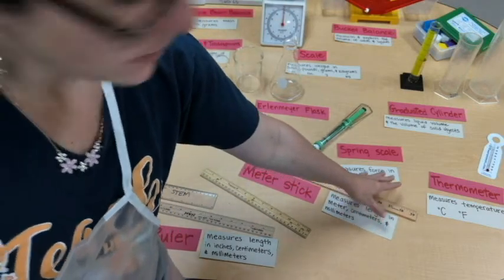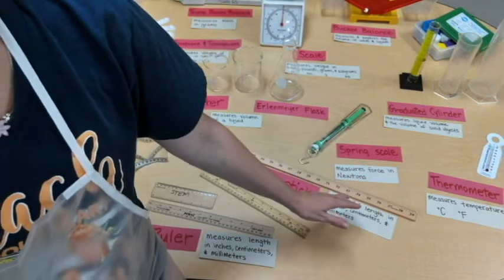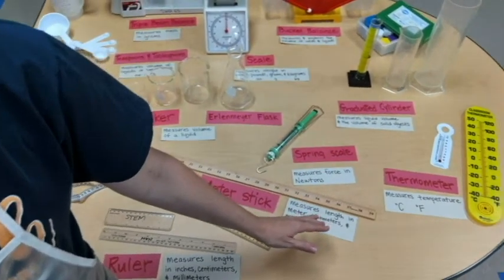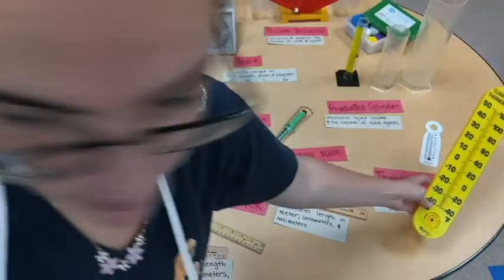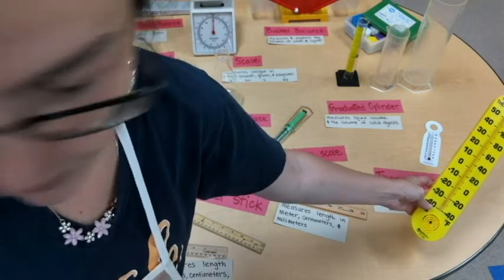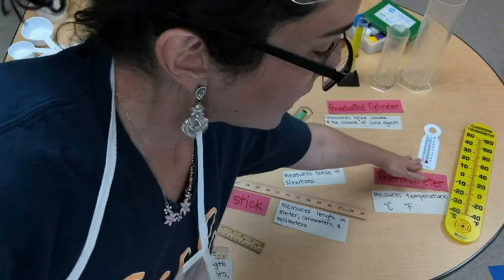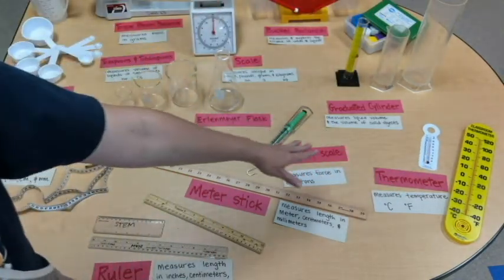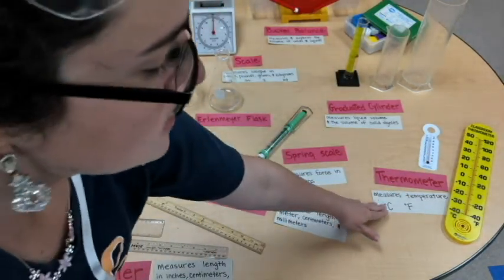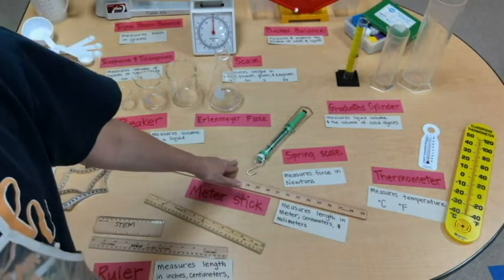Over here, we have our thermometer. And they might come in different shapes or sizes as well. Here we have a jumbo one. It's yellow. But it has the same measurements and accurate reading as a smaller size. And that measures temperature, Celsius or Fahrenheit.